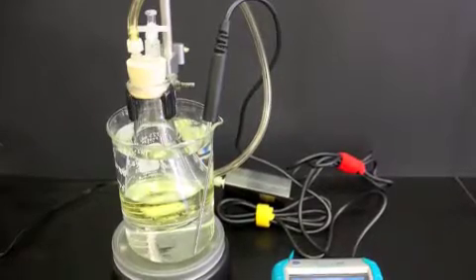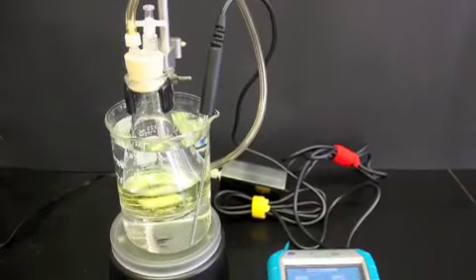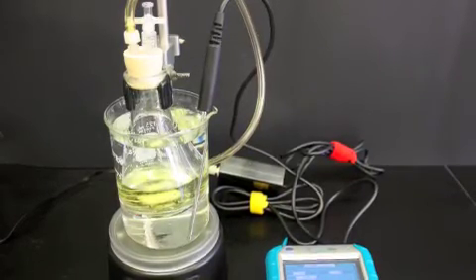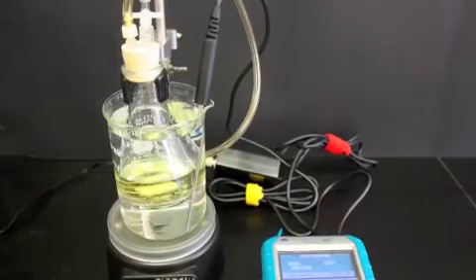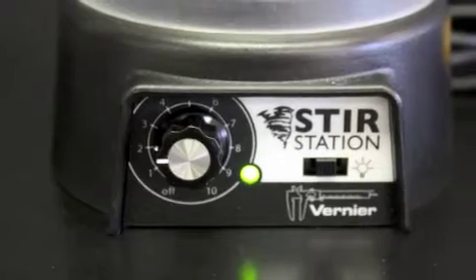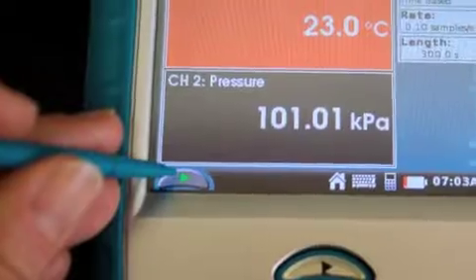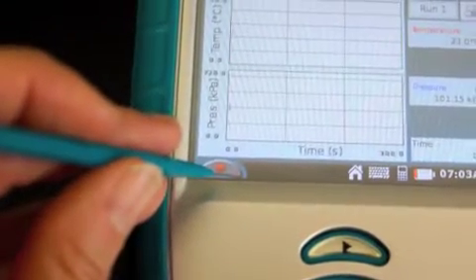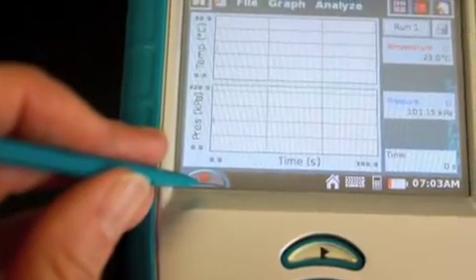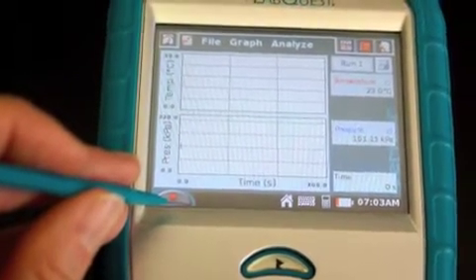After adding your hydrogen peroxide, quickly attach the rubber stopper connected to the gas pressure sensor to the top of the flask, making sure that it is airtight. Place the stainless steel temperature probe in the water bath and adjust the stir rate on the magnetic stirrer to the predetermined setting. Click the Start button on the lower left-hand corner of the screen, and you should see data start being collected immediately. You could stop this trial at any time by punching the red square Off button, but the LabQuest will do all the work for you.